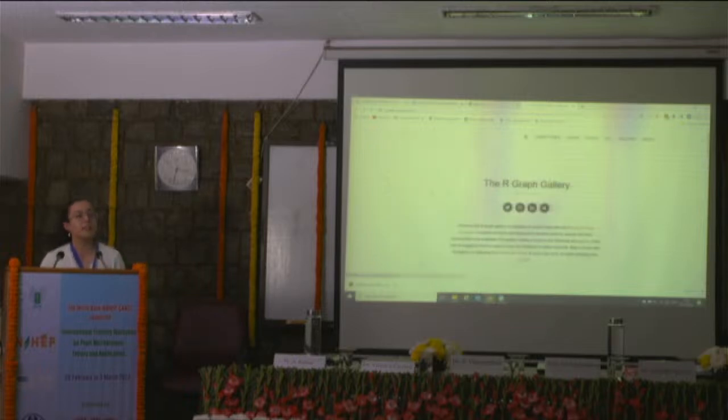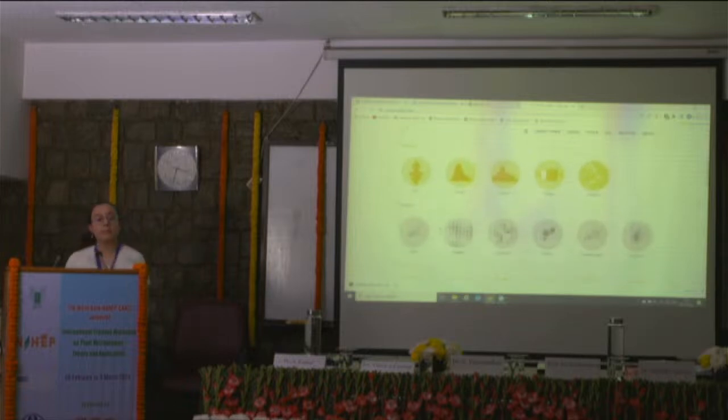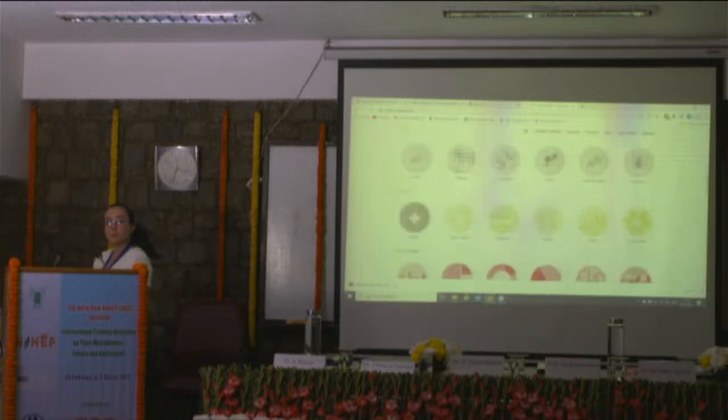So this has a lot of options for plots. Personalized plots with different colors. Maybe you want to change the size of the font or the position of the legend. And they all have it in here, very nicely explained. So what I really like is this. Based on the kind of plot that you want, if you scroll down a little bit, you're going to see many options for plots. So violin, density, histogram, scatter, heat map. There's also bar plots, which we did already.